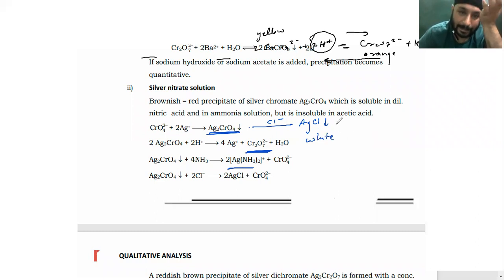It's a very nice reaction to witness, right? Where the live example of precipitate exchange reaction takes place. A salt which has very low Ksp will displace the anion from the salt which has very high Ksp, and both are in precipitate form. So one precipitate is converting into some other precipitate in this.